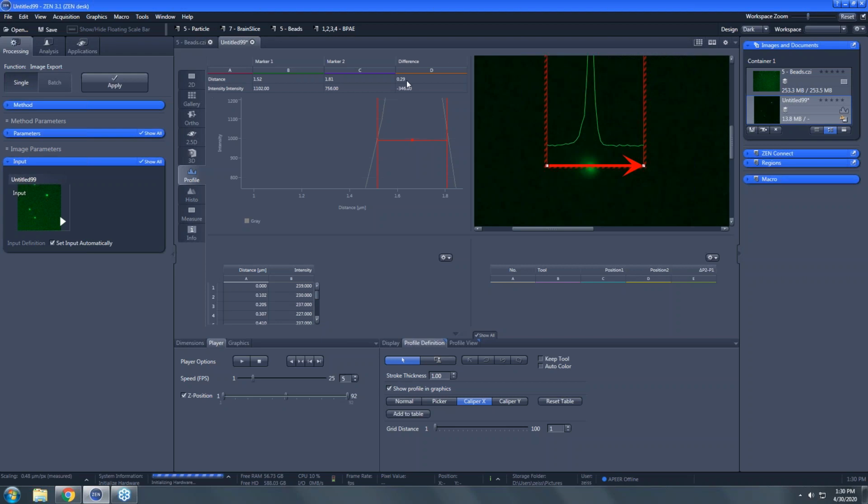Okay, that's it for our measuring with our profile tool. Do you think we got everything there, Nicole?